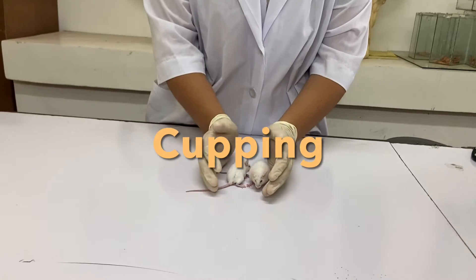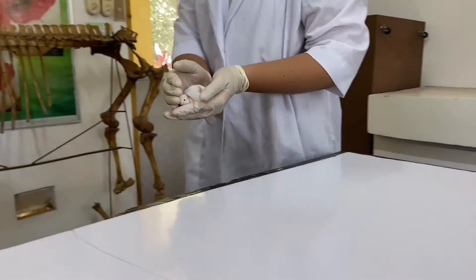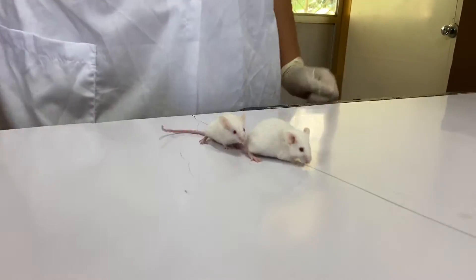Cupping: cup or scoop the mice onto the gloved hands, then loosely close the hands around the animal. This method is preferred for transferring mice over a long distance.